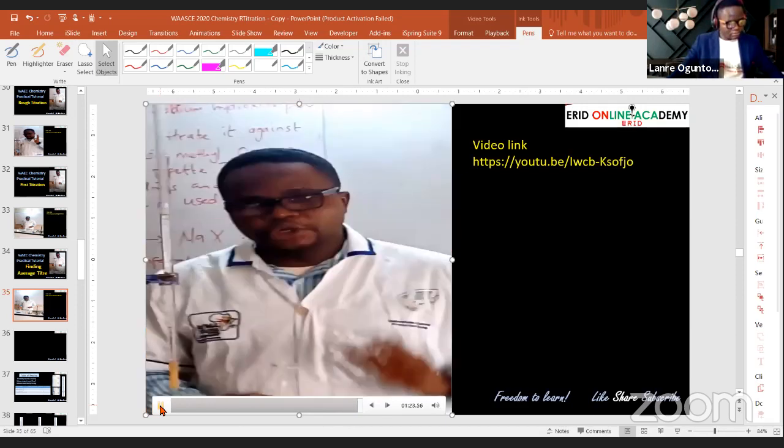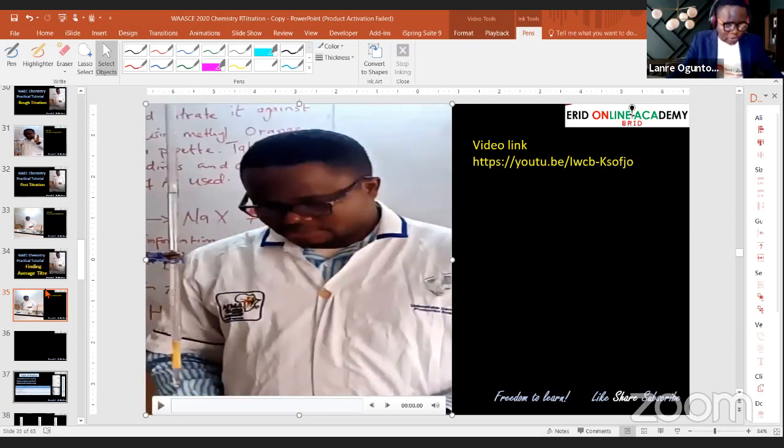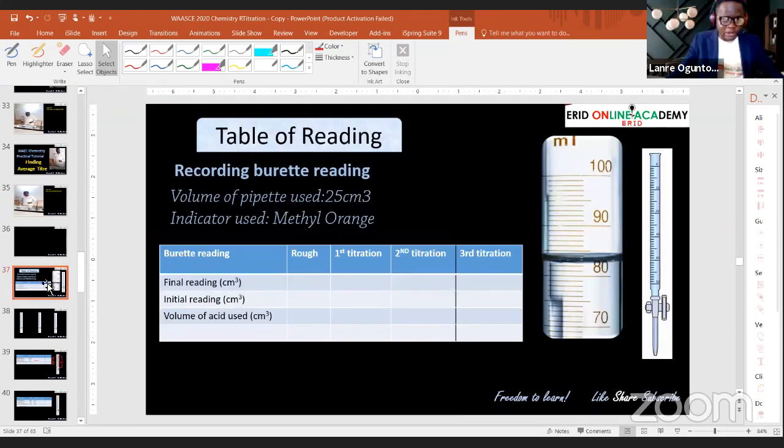Don't include your rough value. Remember, the moment you finish your titration, the next thing will be recording your result and doing calculation.